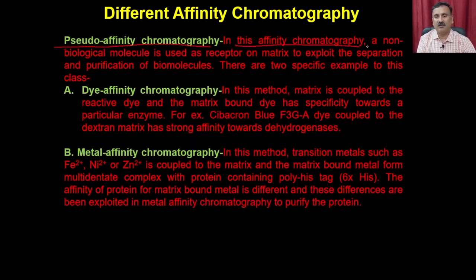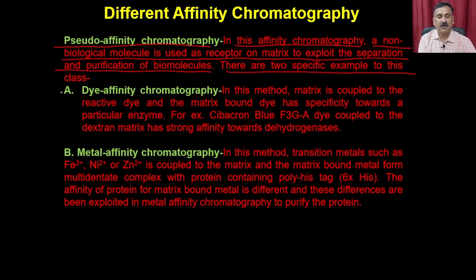So in this affinity chromatography, a non-biological molecule is used as a receptor on the matrix to exploit the separation and the purification of the biomolecules. There are two specific examples. You can have the dye affinity chromatography.